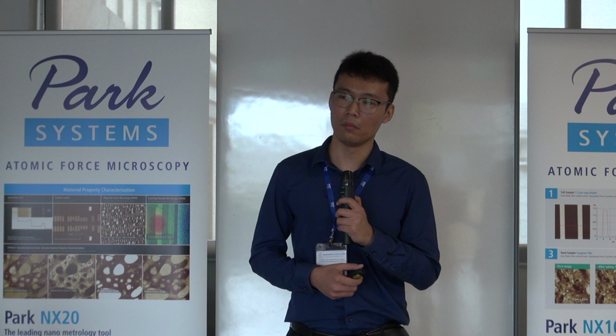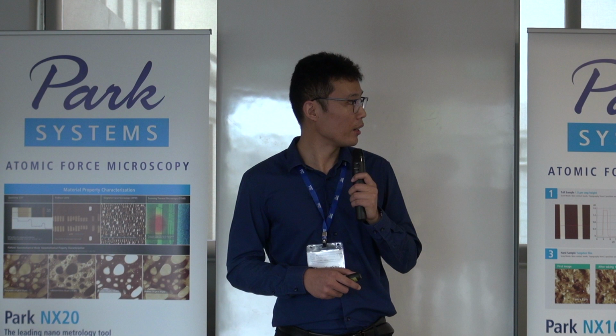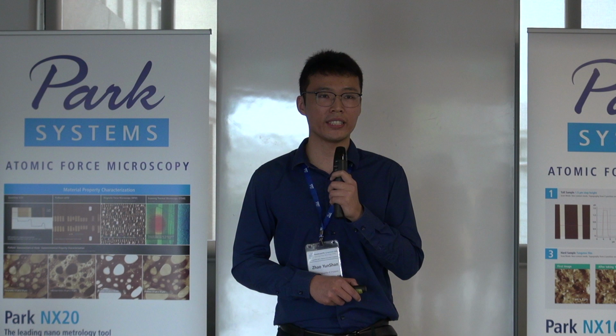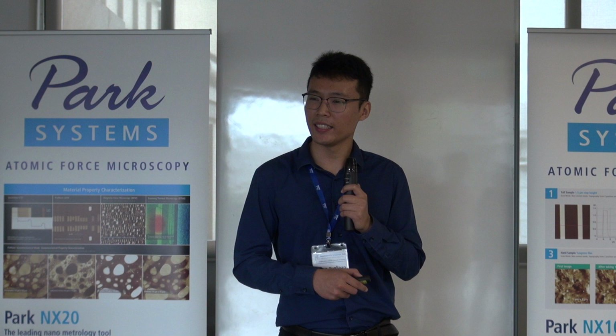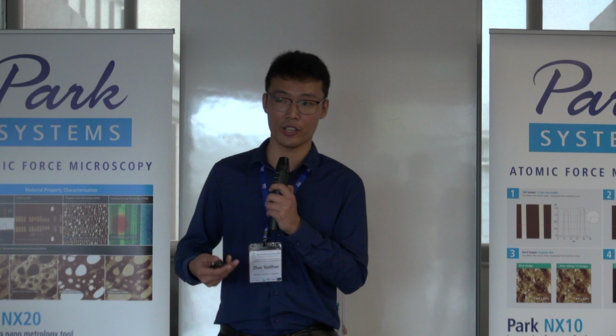Yeah. That's why every time before the measurement we do the calibration. We have the standard silicon. Every time before our porous silicon nanowire measurement, we use a roughly 160 nanometer silicon nanowire for calibration until we get the 160 gigapascal for the silicon. After that, we do the real measurement for the porous silicon. So, you're right. Maybe the contact area is a critical parameter for the extraction. Yeah, I agree with you.